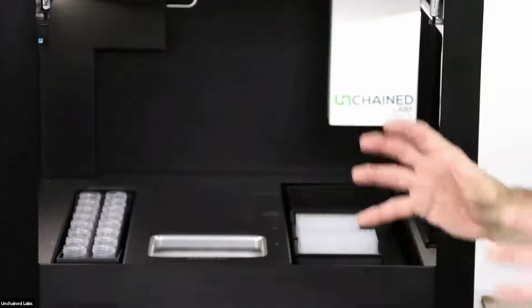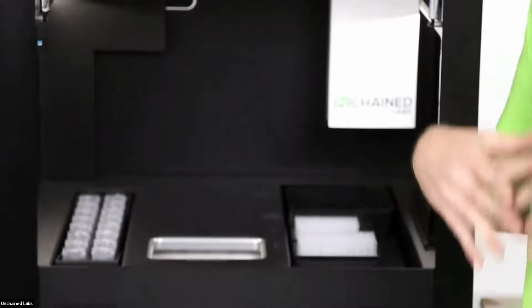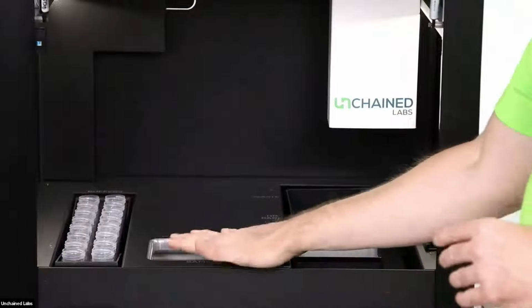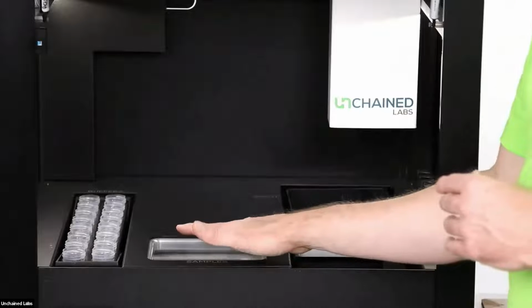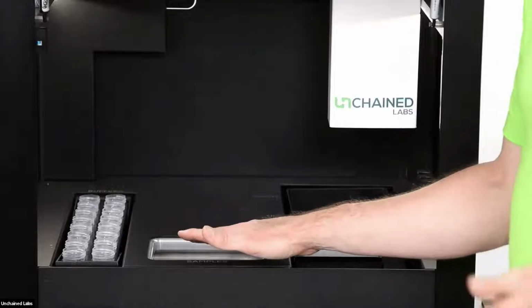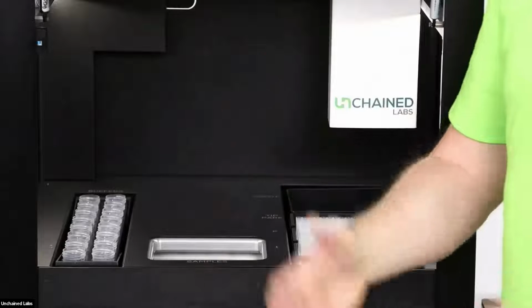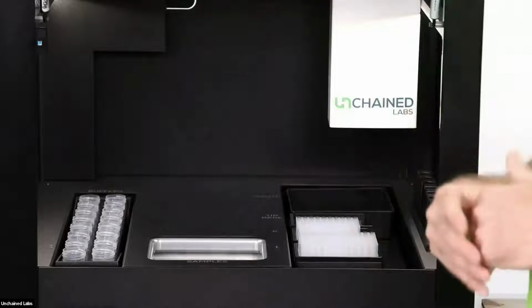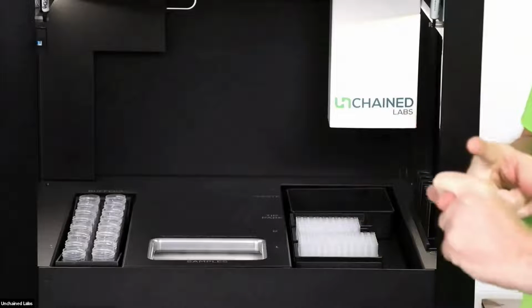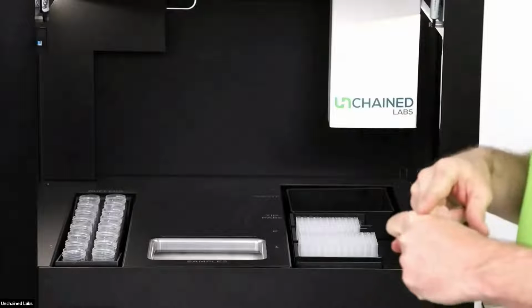And that's one of those things that you're able to modify or program, or use one of our preset settings that's tailored for specific biomolecules. And again, that orbital mixing happens when the buffer exchange chamber door is shut and it's pressurizing. That keeps your biomolecules of interest off that membrane interface and up in solution, giving you, again, faster exchange as well as a higher sample recovery.